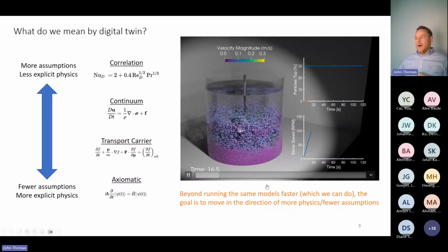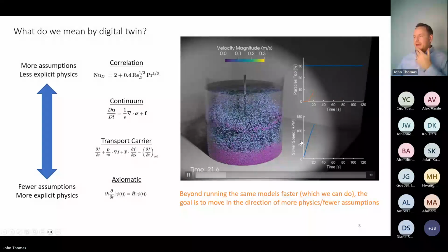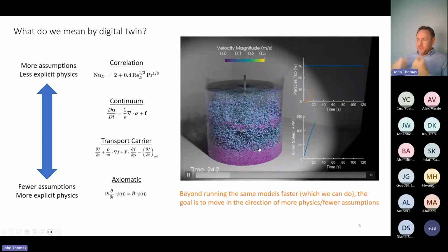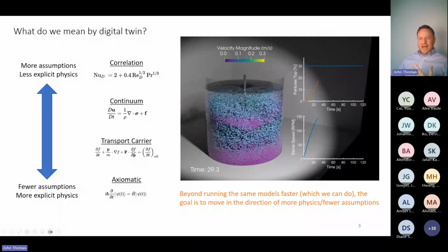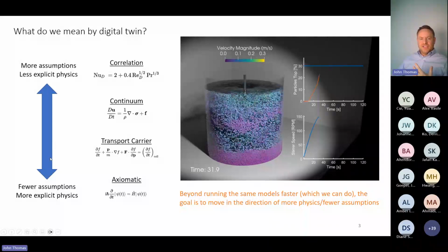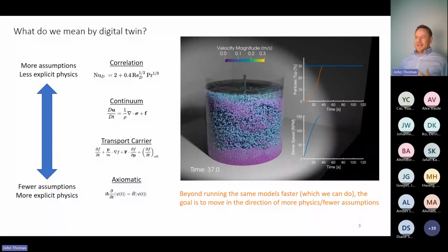The DEM particles are modeled as discrete objects. Here we have a few 100,000, nothing too heavy. And at the end of the day, we're modeling these individual DEM interactions, how they're moving through the vessel. We're doing this all in real time, which is enabled by the advances of GPU computing, which allow us to model not just a snapshot, but a process.